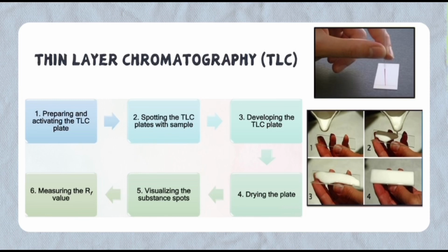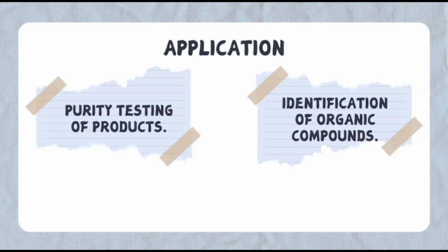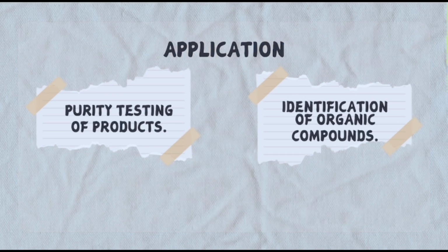Second, spotting the TLC plates with sample. Third, developing the TLC plates. Fourth, drying the plates and then visualizing the substance spots. And lastly, measuring the RF value. Application: purity testing of products, identification of organic compounds.